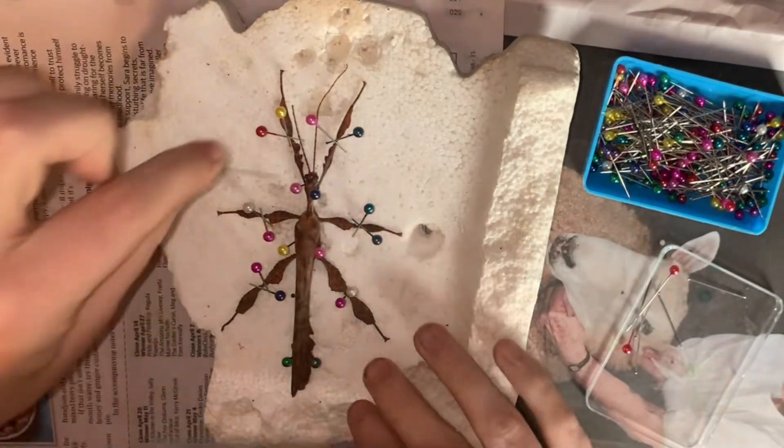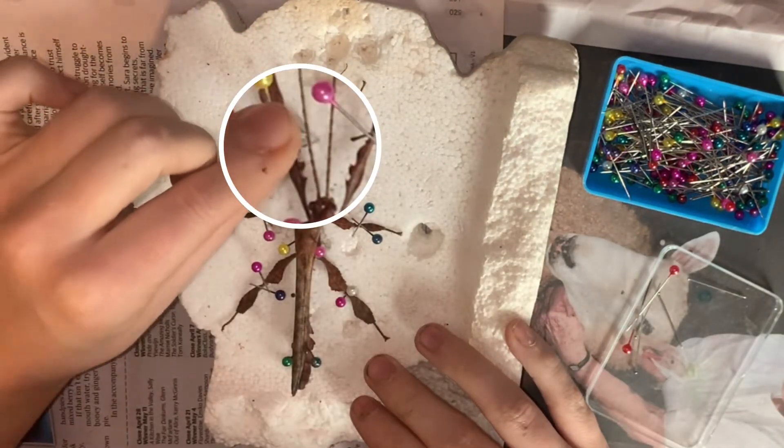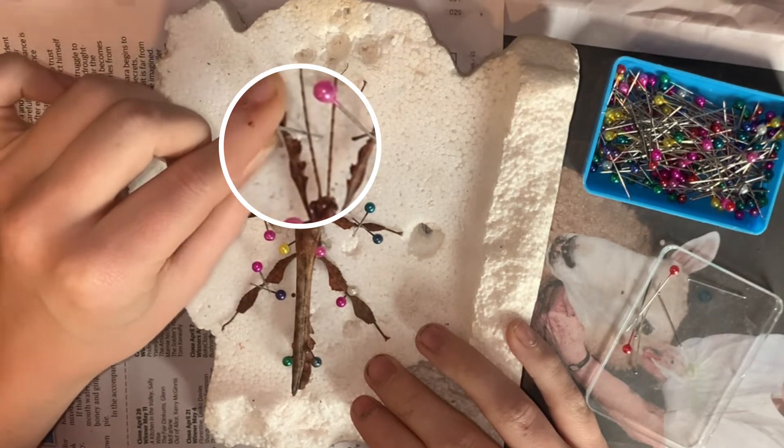The last thing to put into position are the antennae. The antennae are the most fragile part of the body, so take extra precaution when pinning this part.